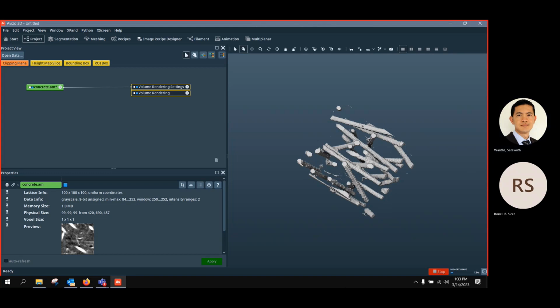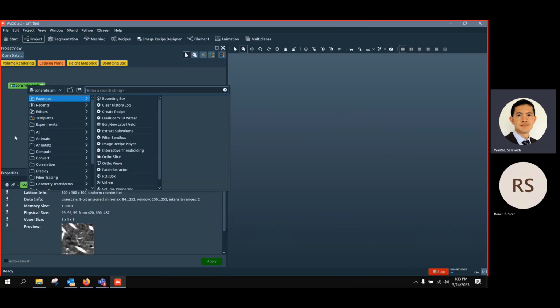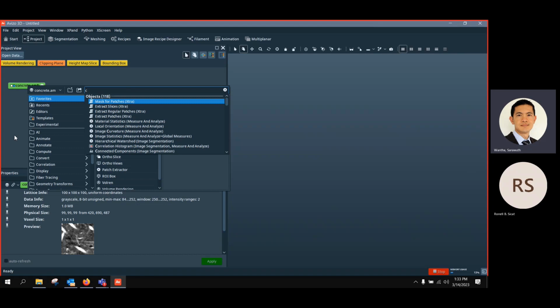In this extension called X-Fiber, we just apply two modules. The first one is cylinder correlation, and after we do cylinder correlation, we're going to do trace correlation line. Let's go into more detail. So the first thing we do is start with the first module, cylinder correlation.